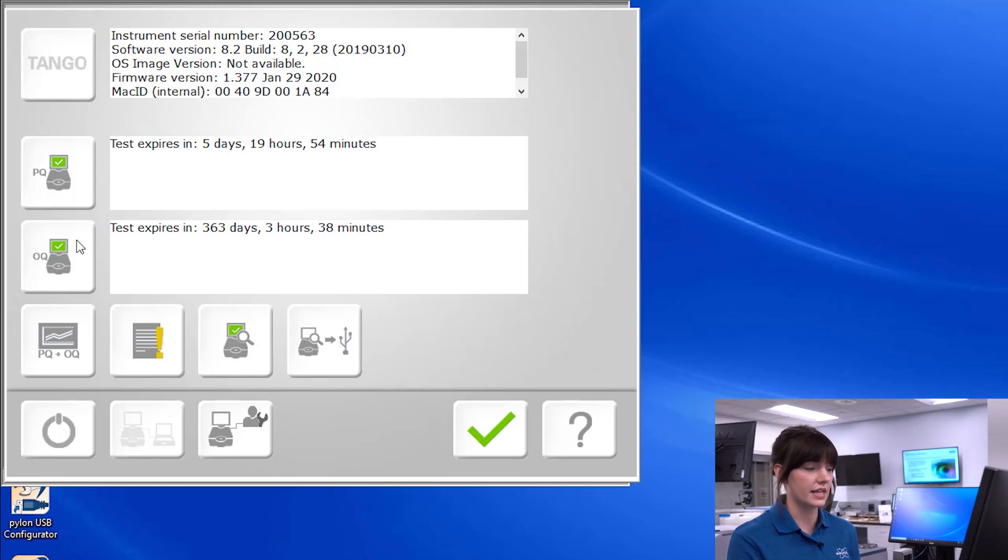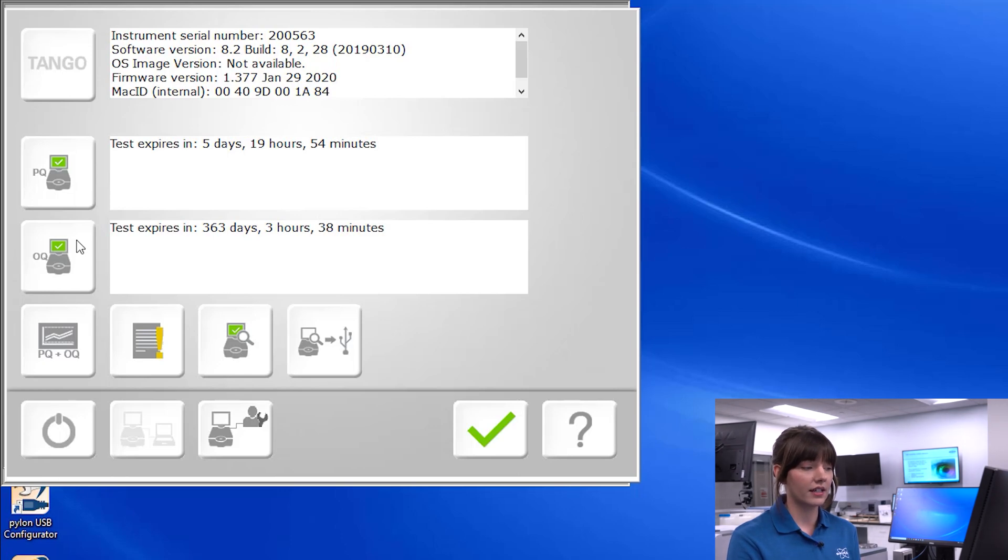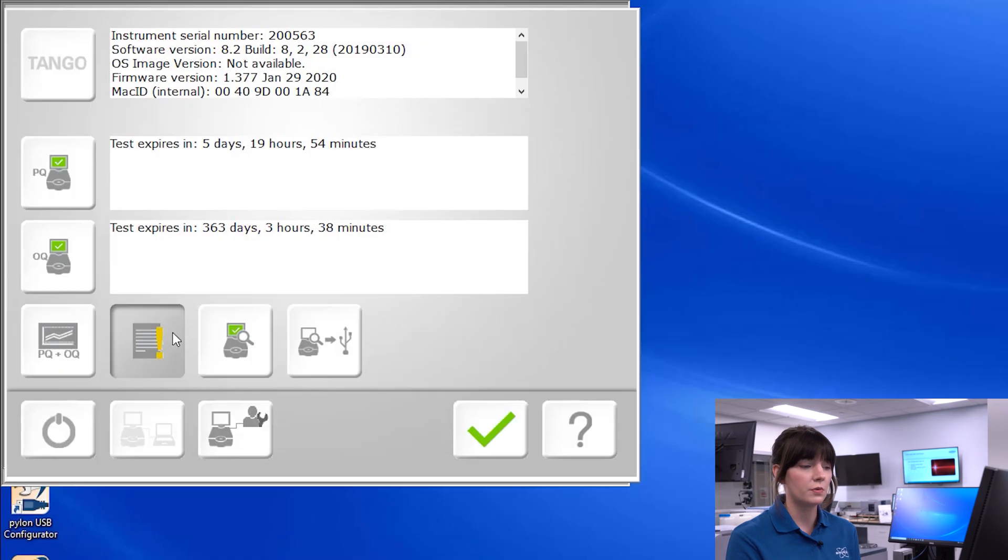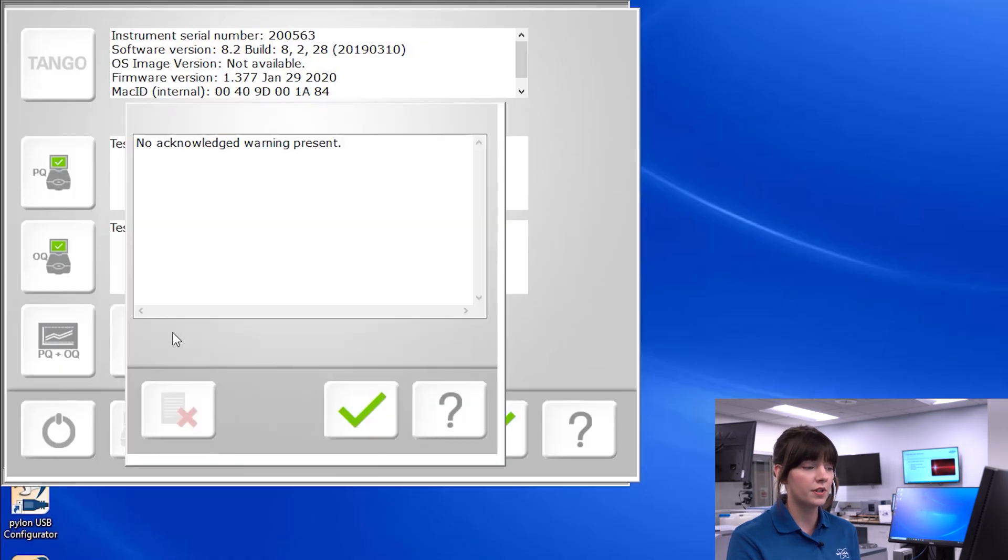For both of these tests, the colors on the icons indicate the status of these diagnostic tests. In addition, this page also provides an icon with an exclamation point, which indicates if any warnings are present and explicitly states what they may be.